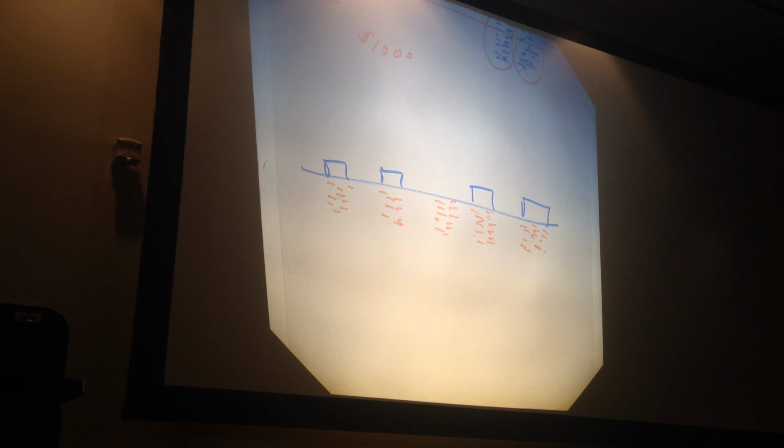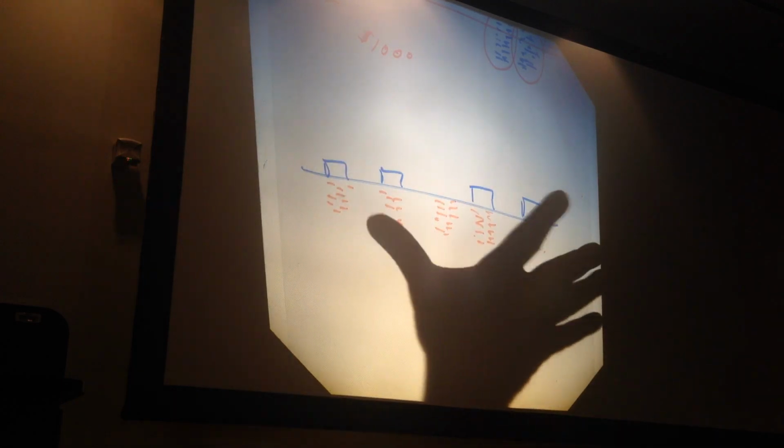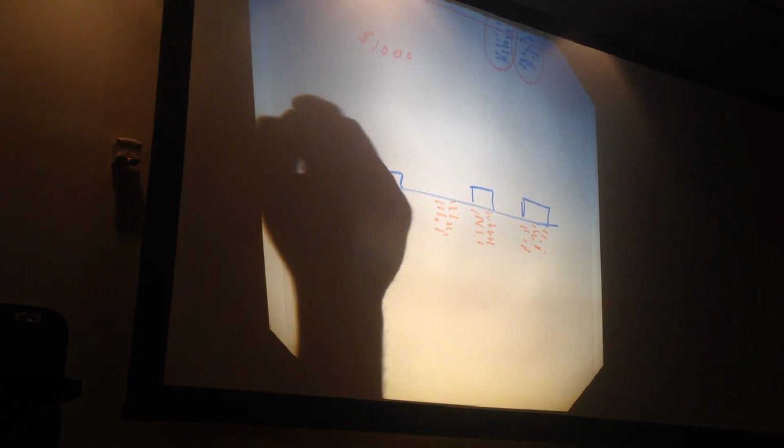Yep. Is this a contiguous sequence of the genomic DNA? Yes, you would basically have the entire genome on a browser. I can look through all of one chromosome at all the hits along the chromosome, and I can scan it. But what we're looking at is 4 exons of a given gene, from 5' to 3'.